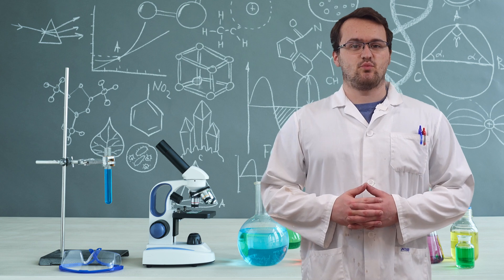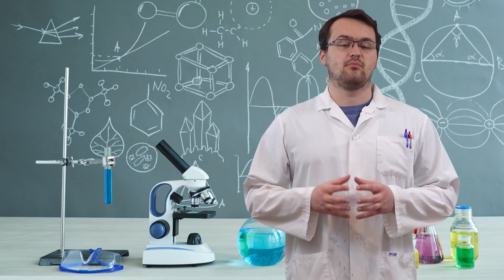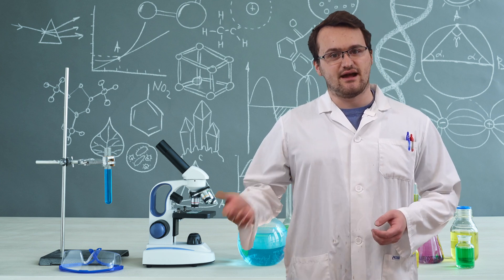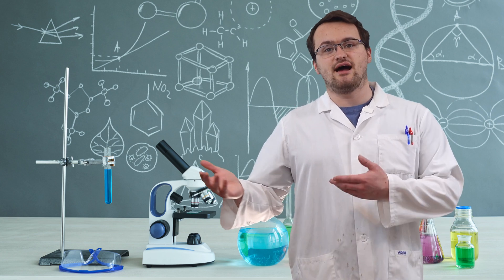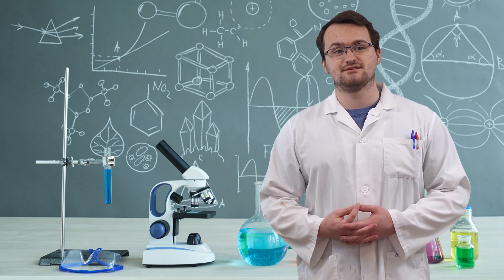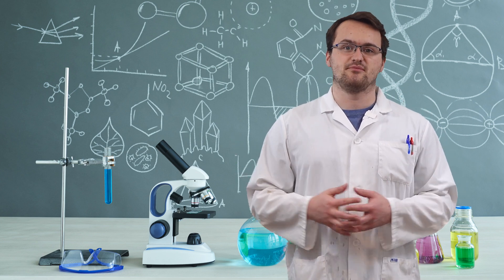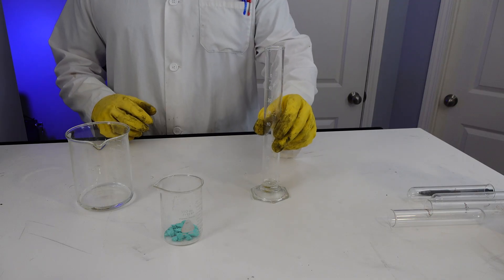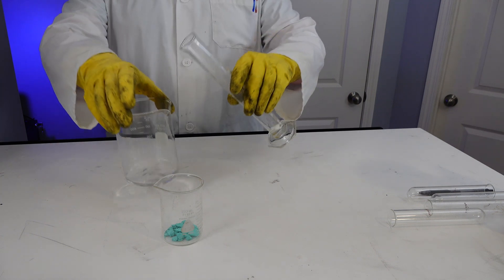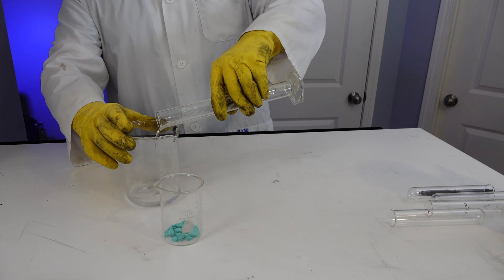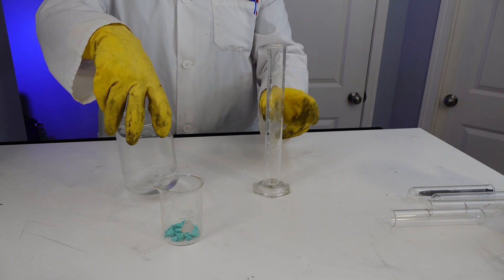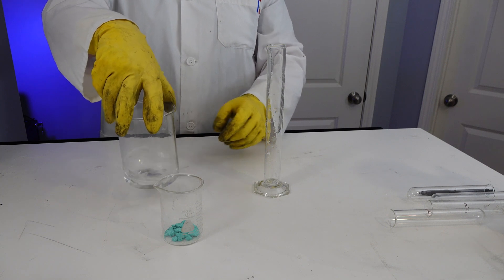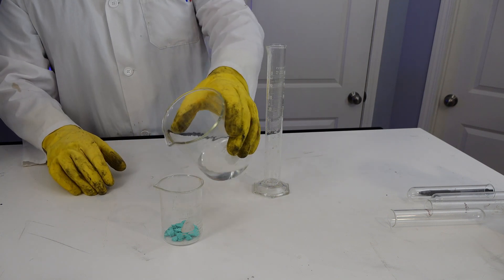Okay, so to start this experiment, what we need is a solution of copper chloride. We are going to start from copper carbonate and turn that into copper chloride. You could make it from copper metal if you like, but we have copper carbonate sitting around from our previous video, so we're just going to start from there. So the first thing I'm going to do, this is just some hydrochloric acid, this is just some water. Add acid to the water just to make a dilute solution. Give that a stir. And then we're just going to add this slowly to our copper carbonate.